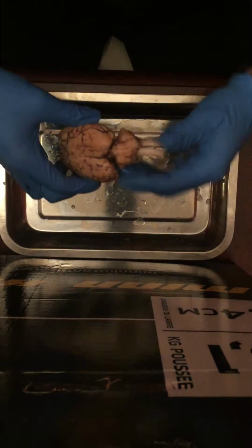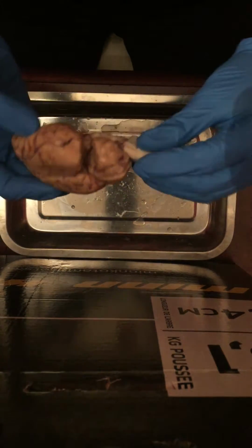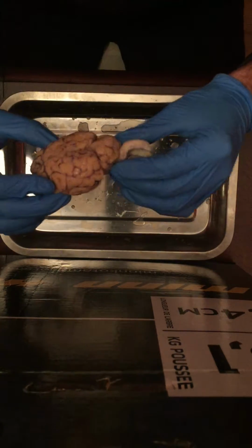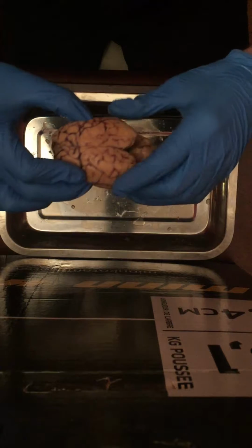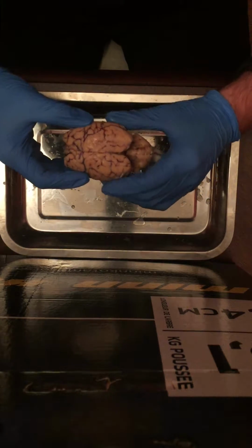First, the whole brain. It's an amazing thing, and it's so surprising that the sheep brain is this similar to the human brain. It's an amazing thing. Now I'm going to show you the lobes of the brain.